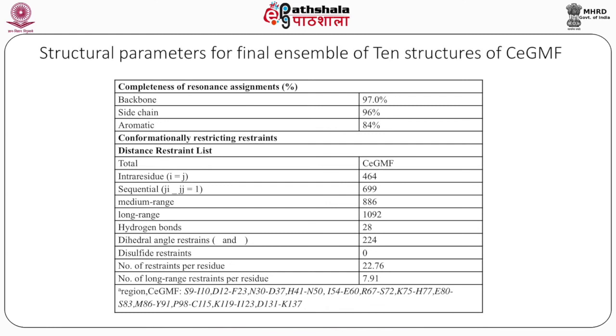There is not a single unique structure that would describe the NMR solution structure of a protein. So, the NMR structure carries with it inherently the information about the disordered regions, the less ordered regions, the dynamic regions, and also correspondingly the rigid regions in the remaining scaffold of the protein.